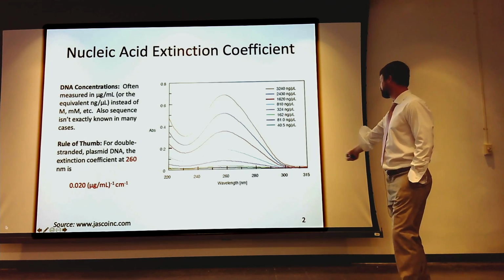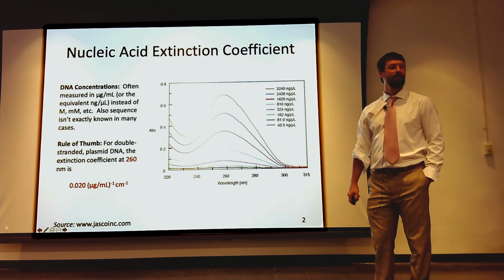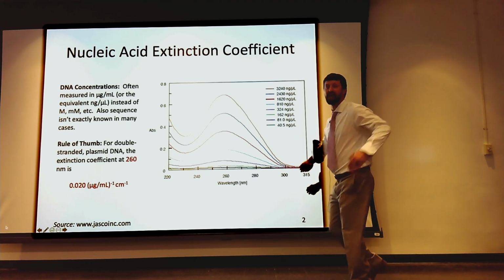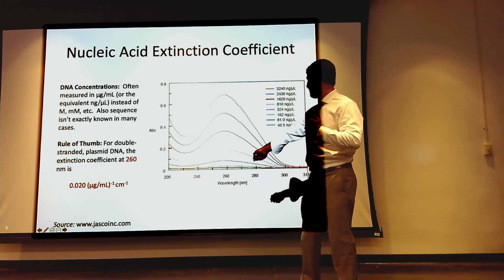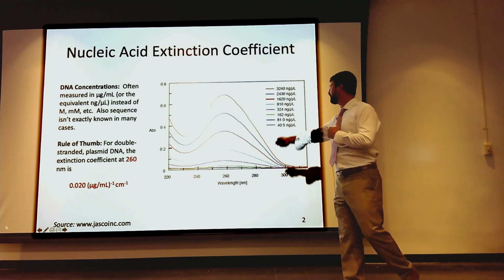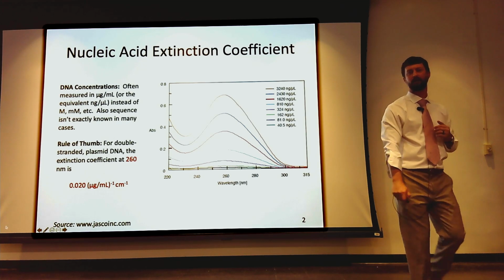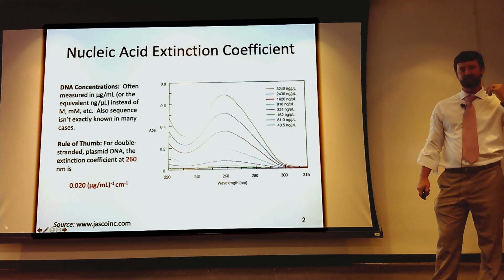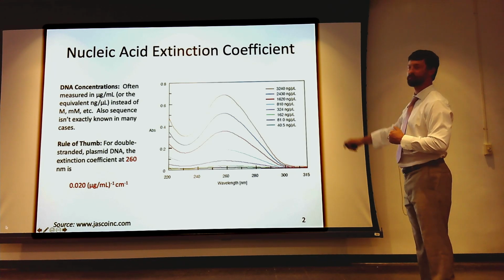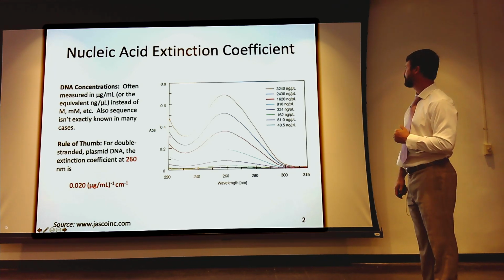It's an absorbance, it's a scan, right? If we take our spectrometer, and all we're doing is we're scanning. We shine some light into our sample, and we scan the wavelength. And this is the amplitude, right? This is how much is coming back. Absorbance is related to percent transmittance, right? We can see how much is absorbed by how much light makes it through.